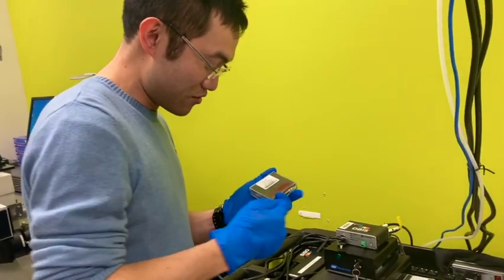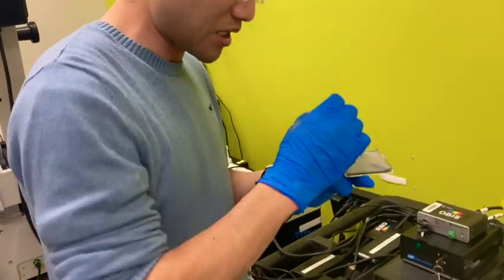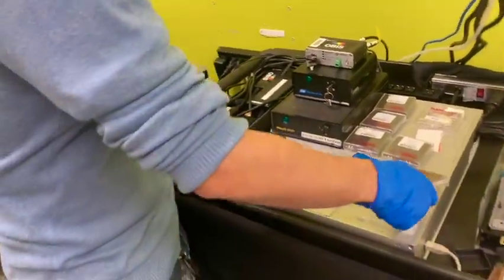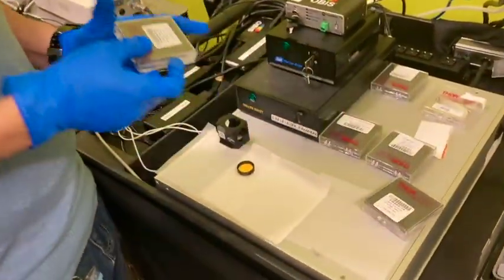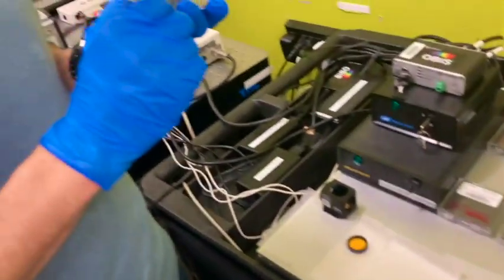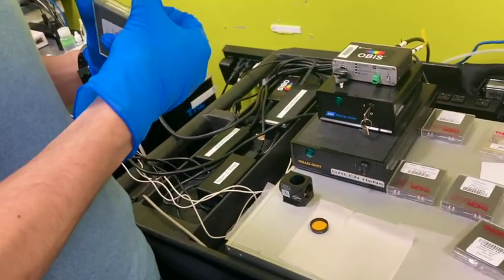quality. And when you look at a filter, how it looks, and have a kind of feeling. So we have different kinds of filters. Basically, what the filter is doing is separating wavelength.